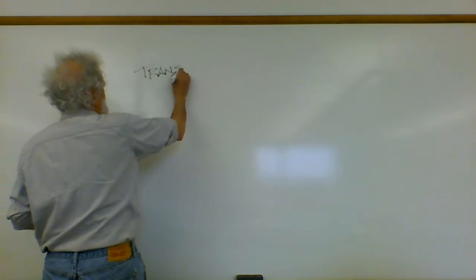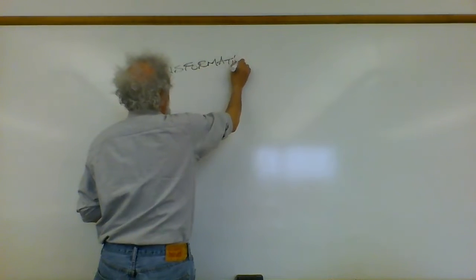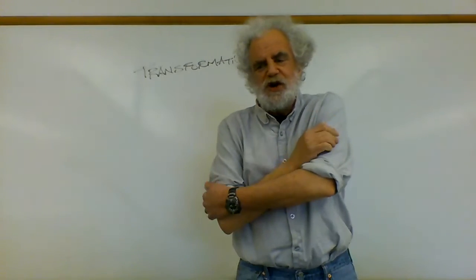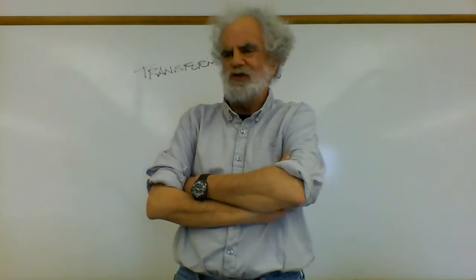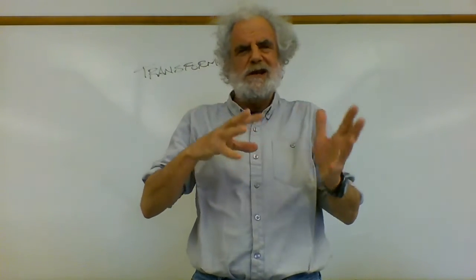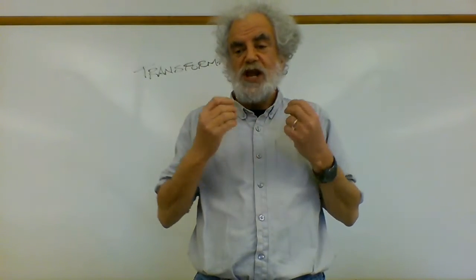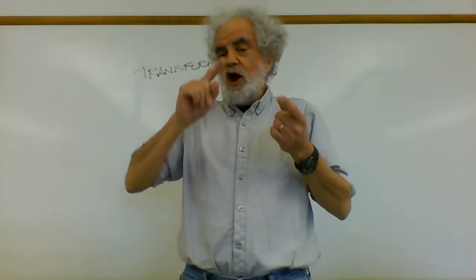transformation. Now, just to provide a bit of historical background, the term transformation comes from an experiment done by Oswald Avery and Griffith and MacLeod, in the 1930s, 1940s, when the idea that DNA was in fact the genetic material was not yet fully understood.